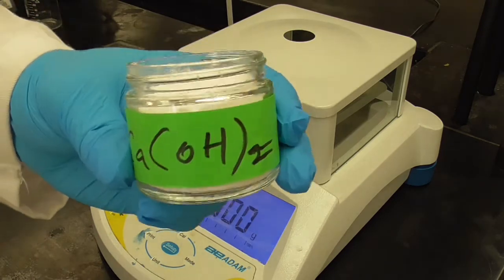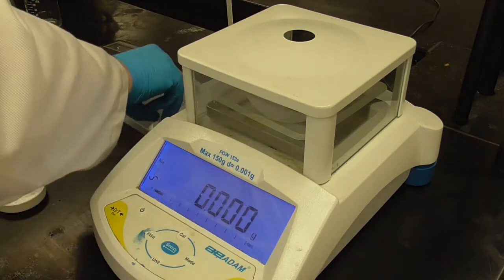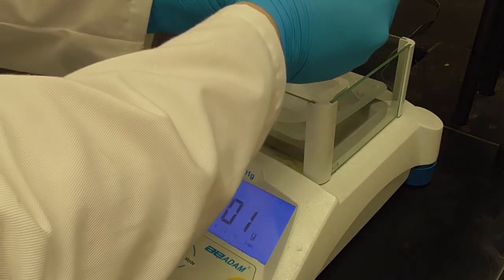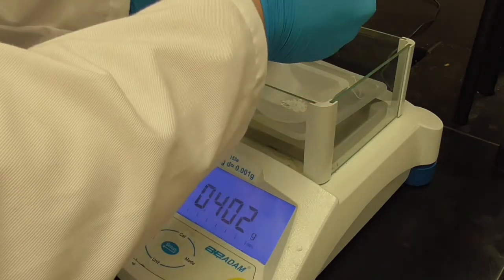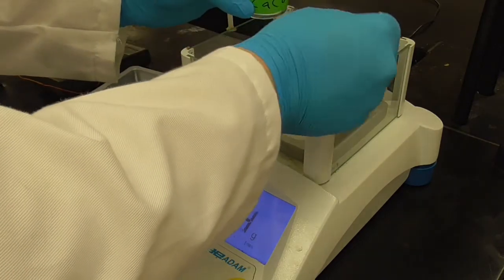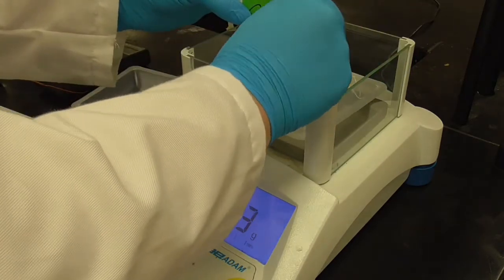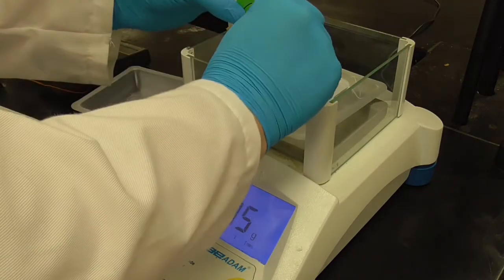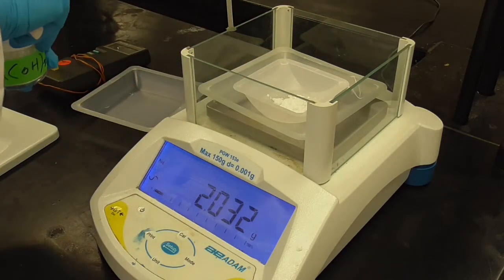And I have calcium hydroxide. Okay, and you can see there it's this nice puffy white solid. And I need approximately 2 grams, which is way more than the saturated point, so this will make sure it's saturated. Get about 2 grams. Doesn't really matter exactly how much because there's going to be way more excess solid left anyway.